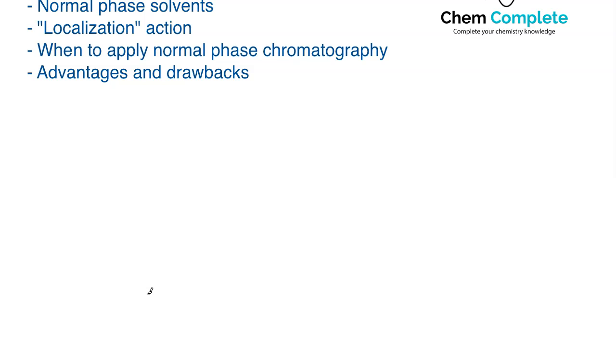Okay, so it's usually considered a secondary option to reverse phase. And we'll talk about that more soon. Reverse phase tends to be the one that is prioritized for research and development, even though normal phase came first. But that's why it's called normal, it was the first one present. And then reverse phase was developed sort of with the reverse conditions compared to the normal phase HPLC. So understanding that, right, normal phase HPLC is going to utilize a polar stationary phase or a polar column.